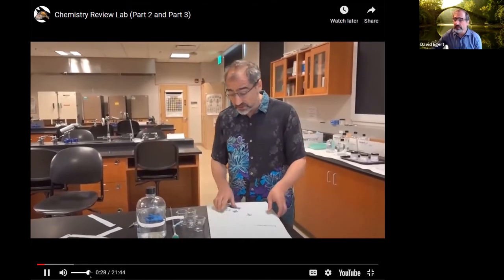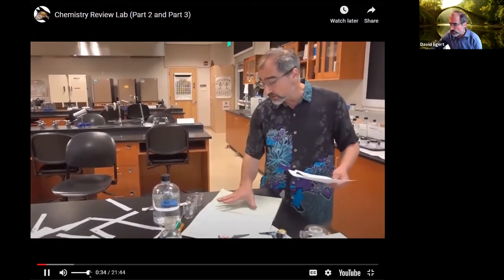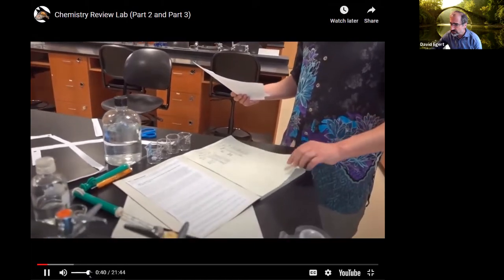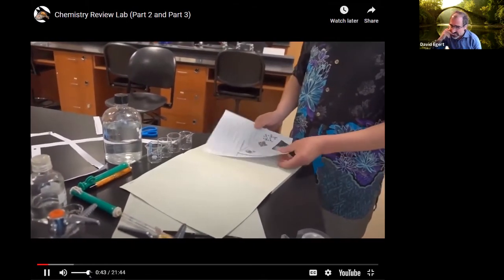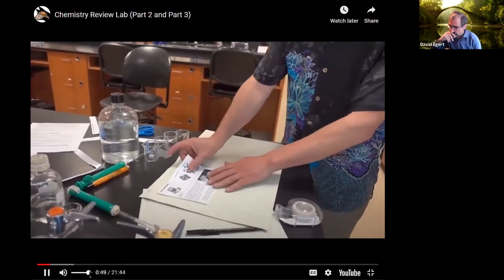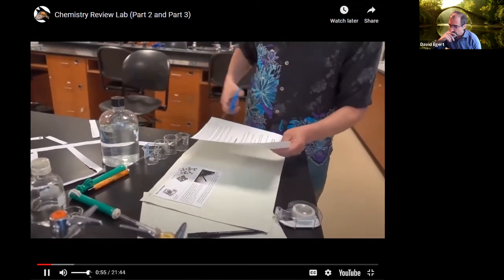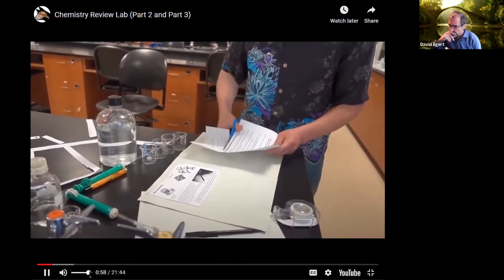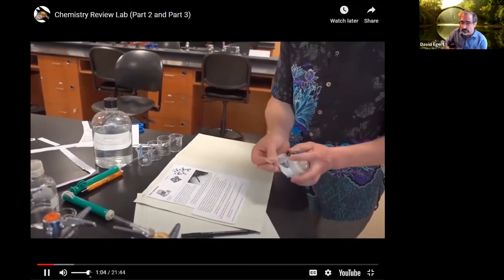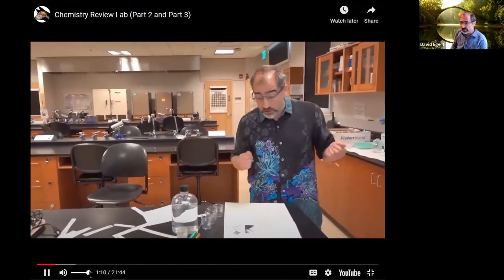And just to give you a sense of the mechanics of putting the lab book together. Here we have data down from the last part of the lab, and you probably leave a little space to write up, but then we're going to have the instructions for part 2 here for electrolytes. I'm doing this quick. In reality, you would do this a little more neatly and thought out. But basically, I have the instructions for the lab right here. You can use a glue stick, which is better than tape, but tape works too.